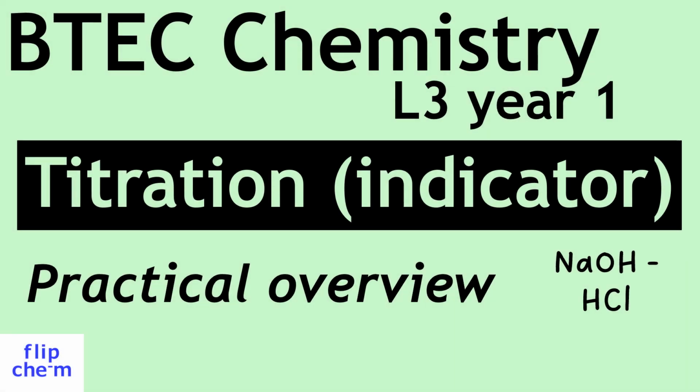Welcome everyone. In this practical overview we'll take a look at a titration between sodium hydroxide and hydrochloric acid. I'll explain how the concentration of sodium hydroxide can be calculated using a known volume of standardised hydrochloric acid.